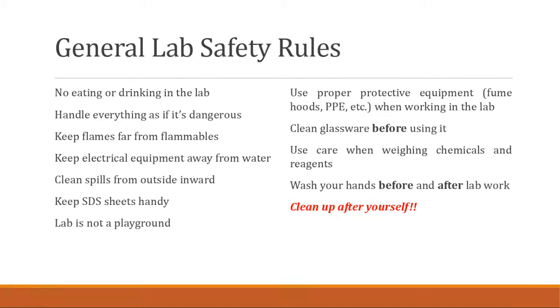The next one that I feel is important also would be not only utilizing proper protective equipment such as fume hoods and PPE, but to wash your hands. And this is not a COVID related tip. This is more of washing your hands before and after lab work, because when you put the gloves on, you're touching items, right?